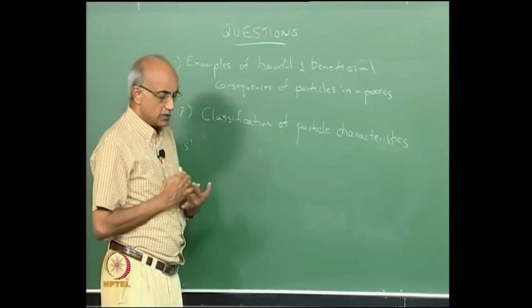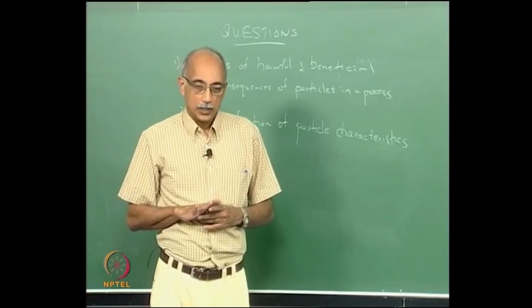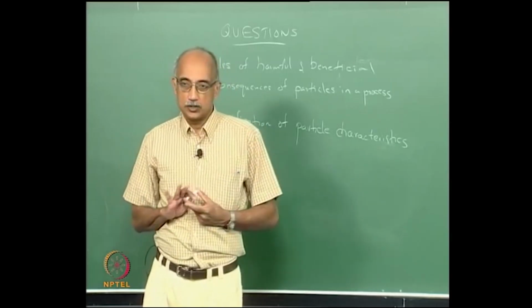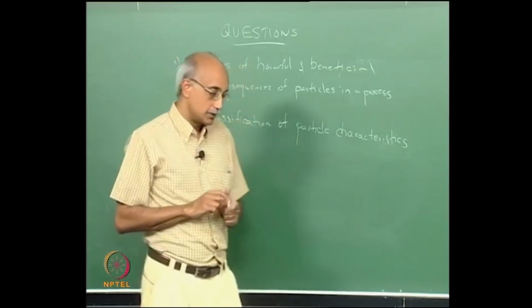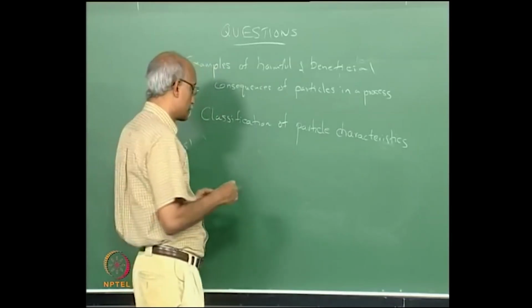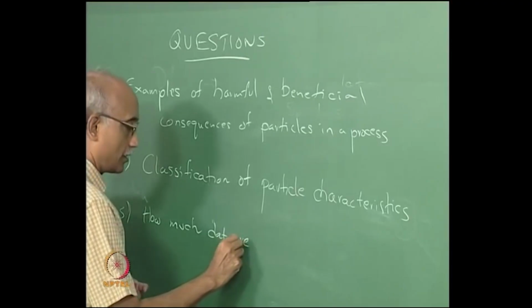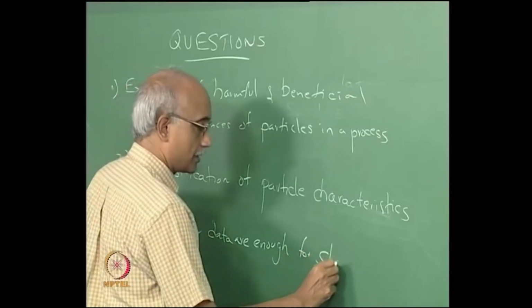Then we started our discussion of shape characterization in a little more detail. And when we talk about shape characterization, I think one of the first things you should have clearly in your mind is: when is the information that you have collected sufficient, or enough, for shape analysis?